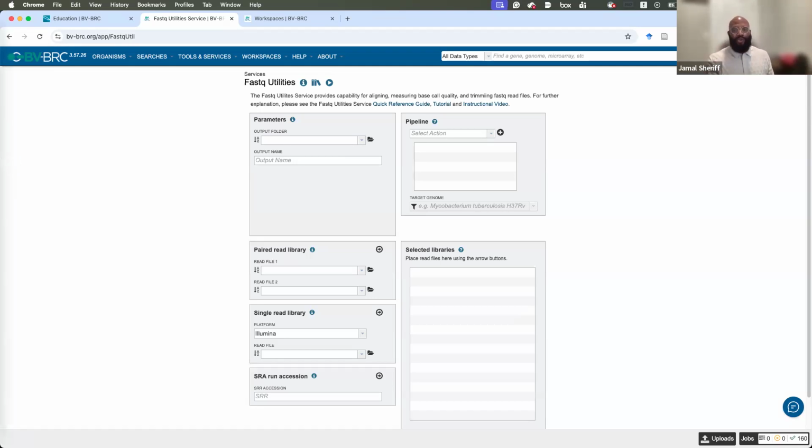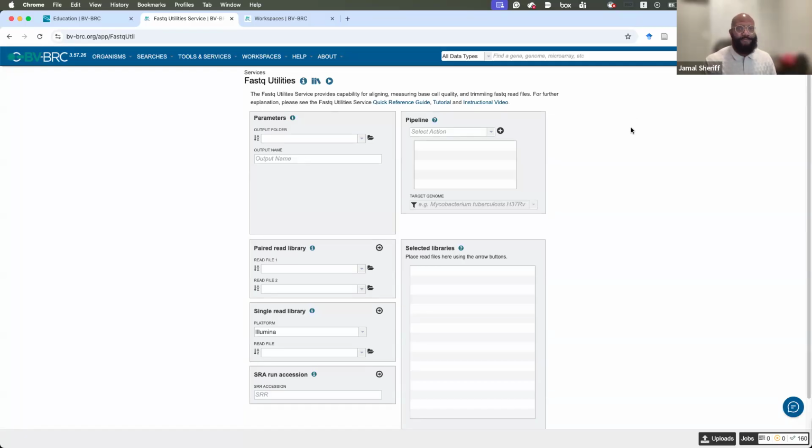You can use the data I provided, and you'll have permanent access to the sequencing data. You can do a little bit of exploration, maybe to see, if you isolated a lactose fermenter, what genes can I find within the BV-BRC using some of our services.